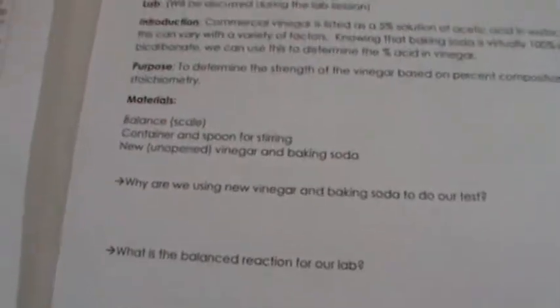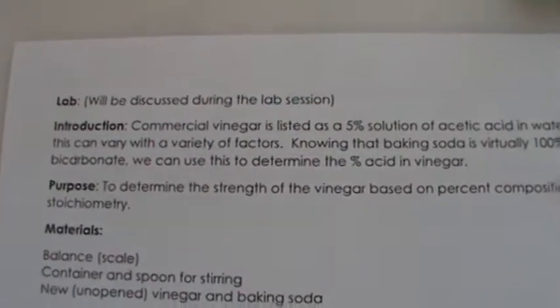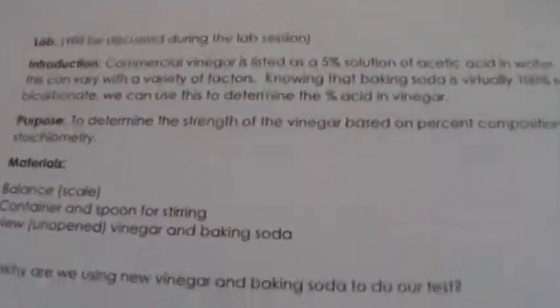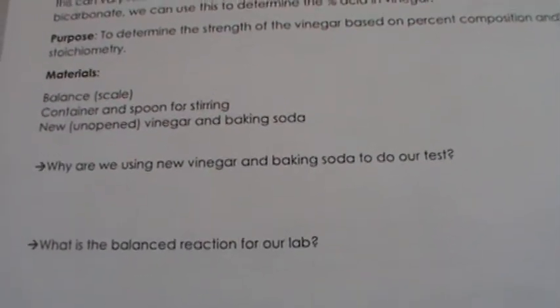Okay, now we'll go ahead and turn this over and we can see the lab. Now I'm breaking my own rules here in that I have baking soda that's already open and vinegar that's already open. And so the interesting thing here is, well, why should you use brand new vinegar and brand new baking soda? And the reason for that is twofold.